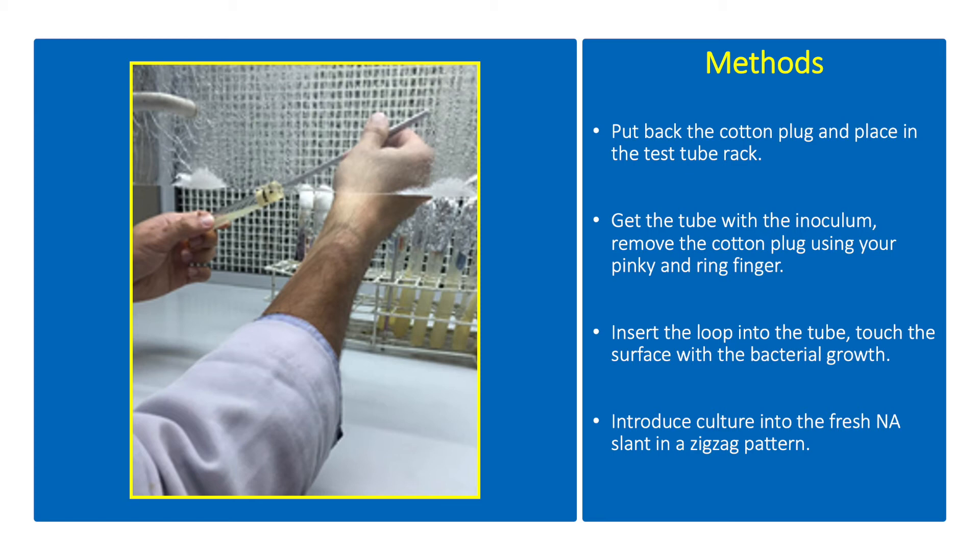Label the tubes properly. Indicate the date of inoculation, name of the organism, and name of the researcher. Incubate at 37 degrees Celsius for 24 to 48 hours.